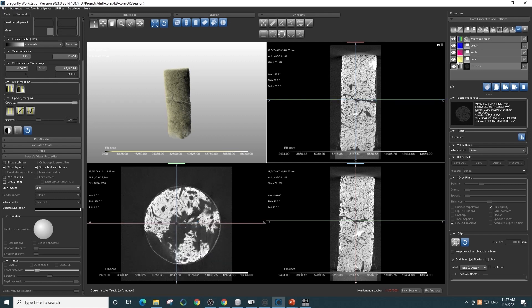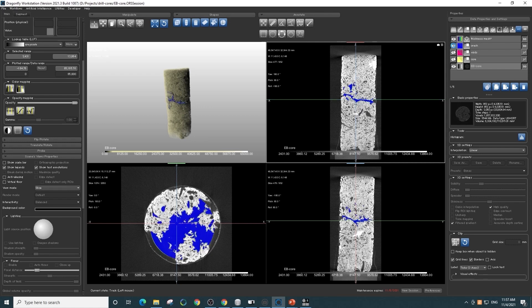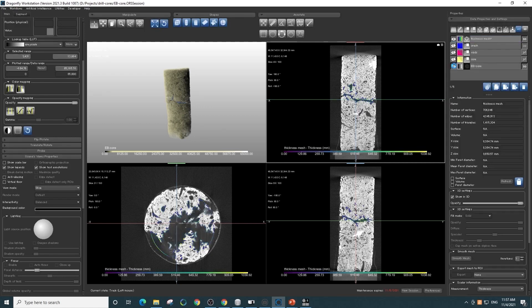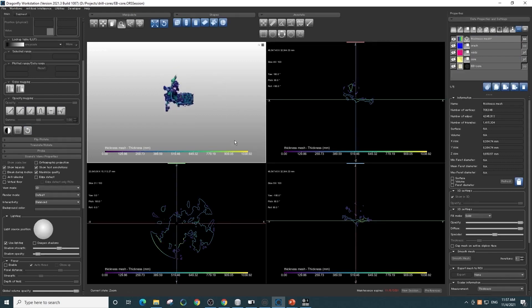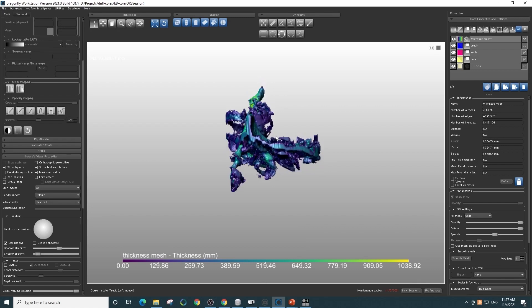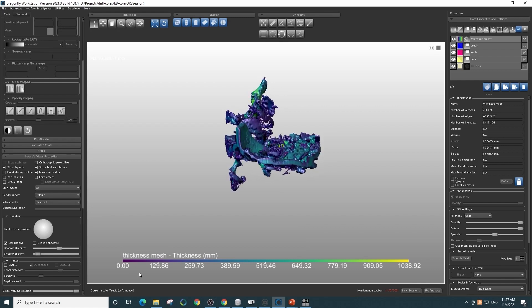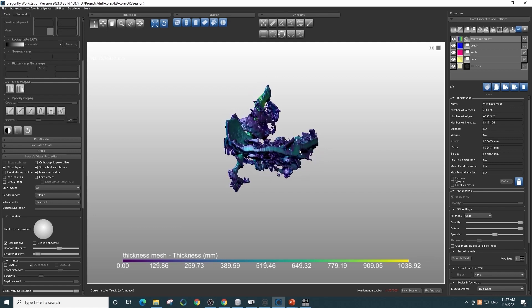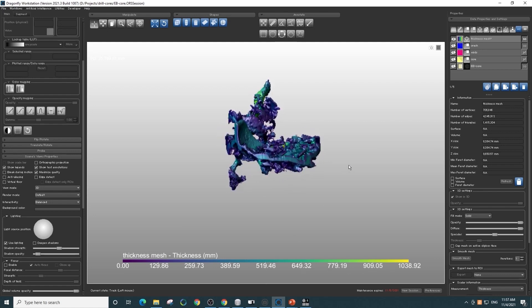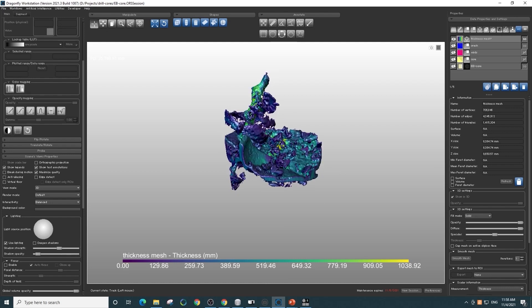What we can also do is segment the core portion from the void portion. If we want to calculate something specifically for that crack, we can select the largest void — which should be the crack because it consumes the most voxels — and then look at a thickness distribution, which is what's shown here. Turning that off and zooming in, we can see the thickness mesh: the areas that are thinnest are shown in purple, and the areas that are thicker are green to yellow. We can see that this crack extends into the core above and below.